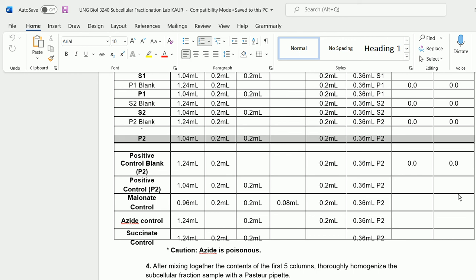So which means that when we do not use azide, the electrons are going to go to the electron transport chain, and they're not going to go to the DCIP. So in this case, you should see reduced reduction of DCIP, because it is not going to get the electrons. The path of electrons is changed: no azide, no blocking, electrons will go to their normal course.